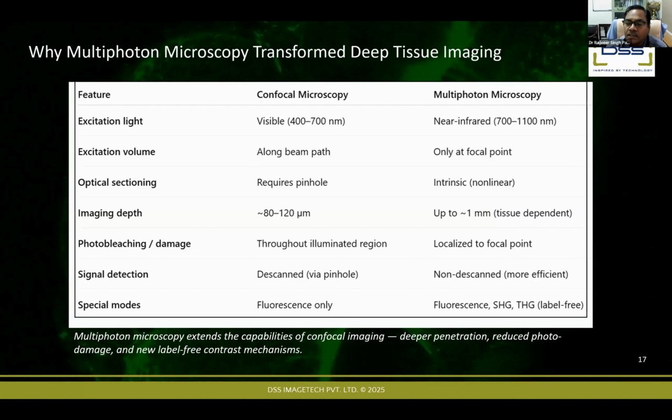Now, is there anything parallel to this? Because this multiphoton microscopy is very expensive also. And what we see there is only light reflected or light absorbed by tissue structure. So I am still not convinced whether that kind of contrast is visible in the latest microscopy.